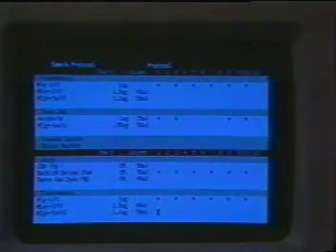If you place an asterisk under the wrong well, you can remove it by using the Del key on the main keyboard. If you wish to erase all of the marks on a pipetting line, use the magic keypad delete command.